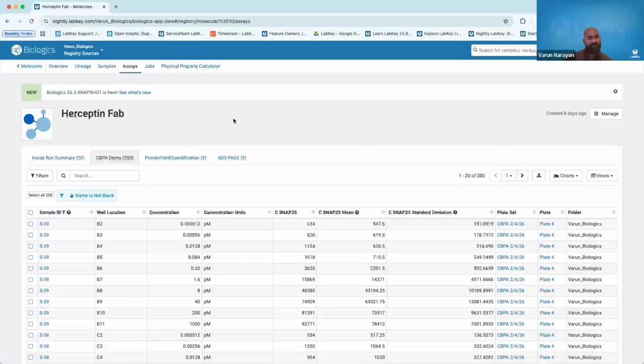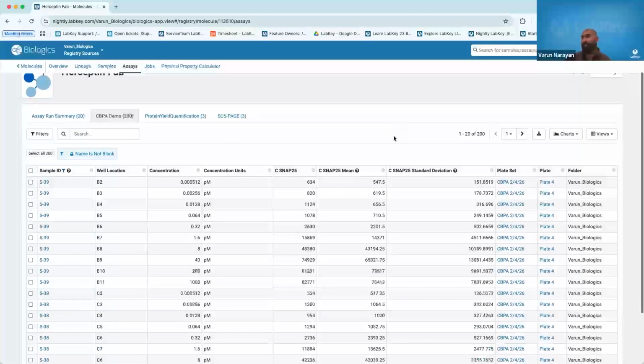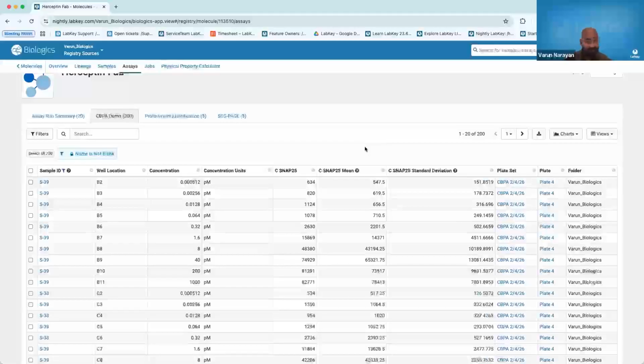So just with one click, something as simple as navigating to a different tab, you can get this holistic idea of, okay, how is all of my data connected? And it allows you to ask questions of your data without the need of a data science team or the need to actually jump into your software and write SQL queries yourself. And you can easily see, from a given molecule, what samples do I have? What are their properties? And if you need to find a given sample to obtain more material to use in further analysis, you can easily do that.